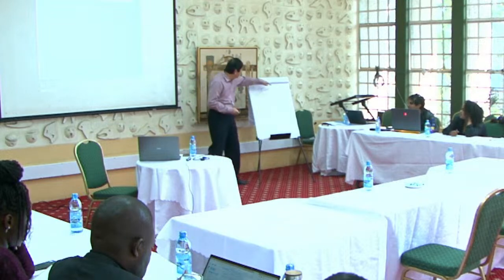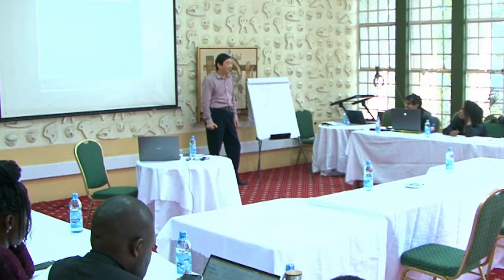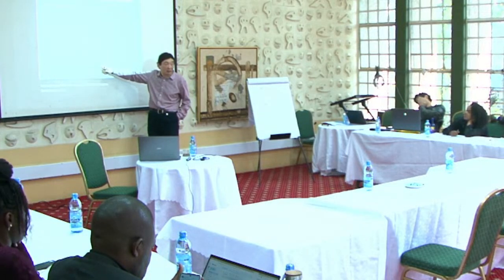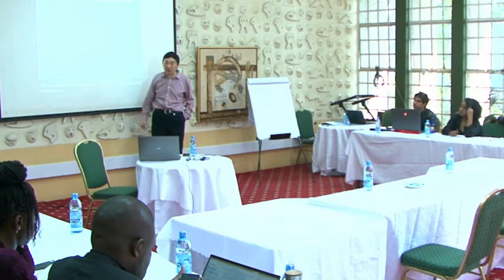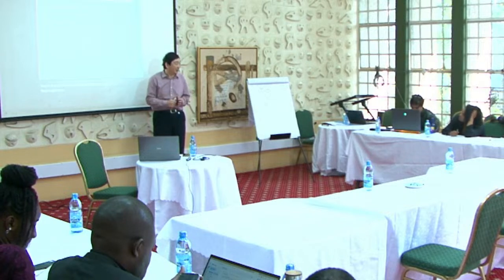Of course, the question is the substitution is OMP, which you do not know. So for that information, probably you have to check the library for small differences between OMP. And so this fragmentation fits very well. For this time we did not talk about the isotope, but you can see you do not have the M plus 2, so you already rule out all these heteroatoms. Okay.